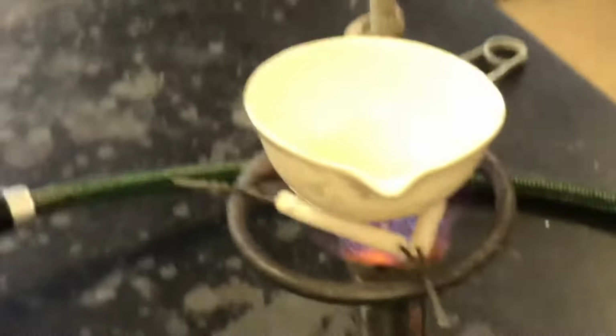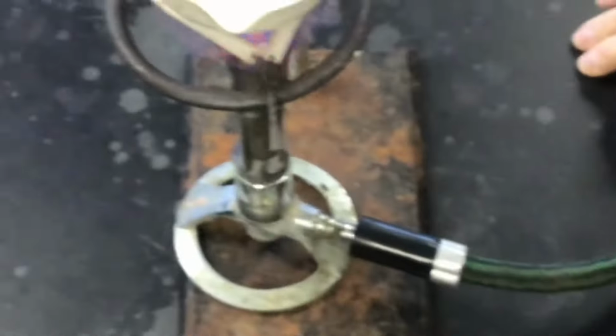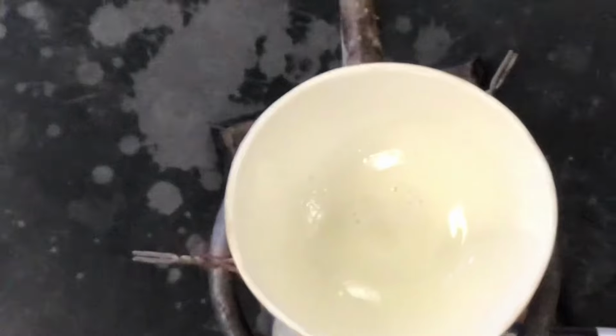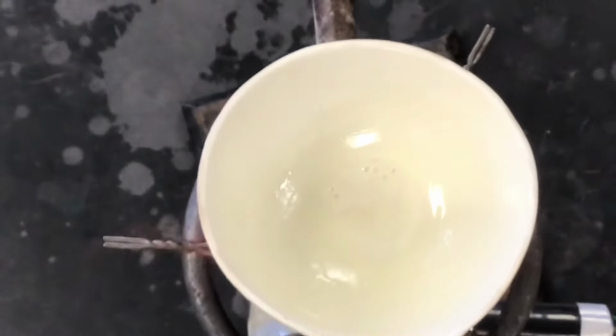Raise this up, you think? Just make sure it doesn't soften our triangle too much. Might.